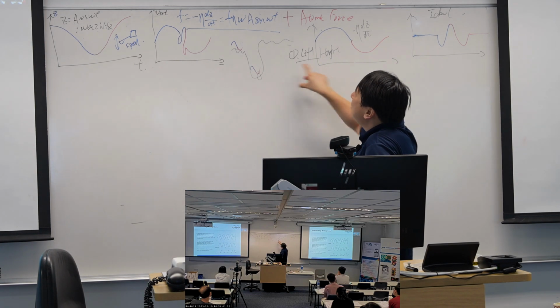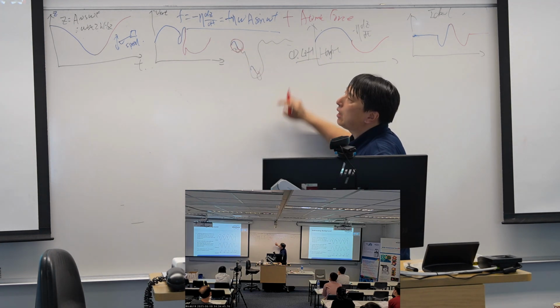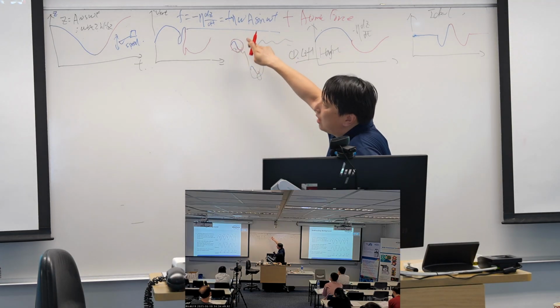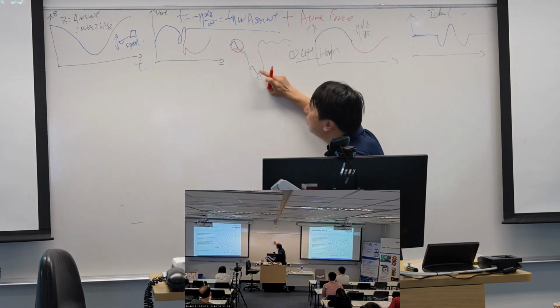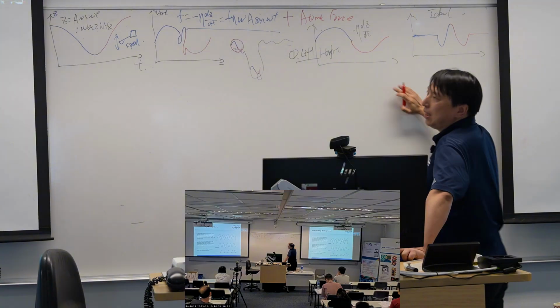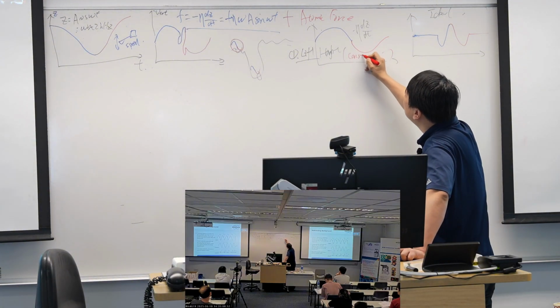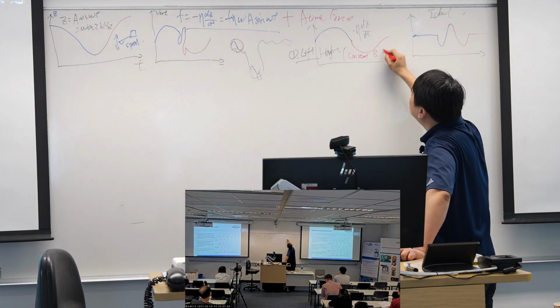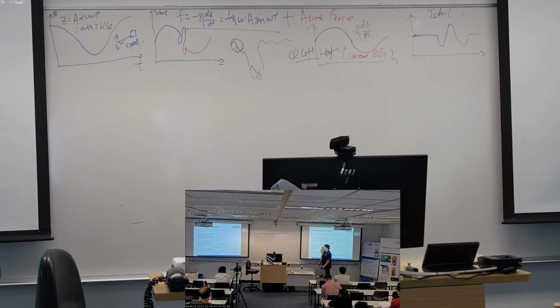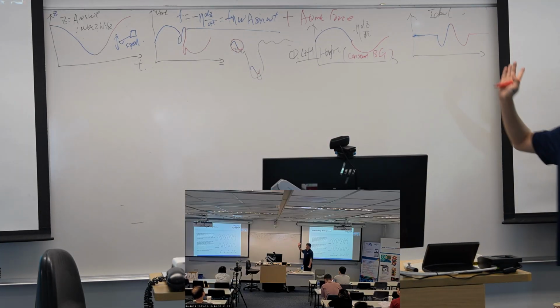For this kind of thing, we set the lift height maybe here, we capture the background here, but the background cannot be applied correctly in the valley. So the lift height mechanism implies we have a constant background. This may not always be true, especially for those kinds of valley or peak samples.